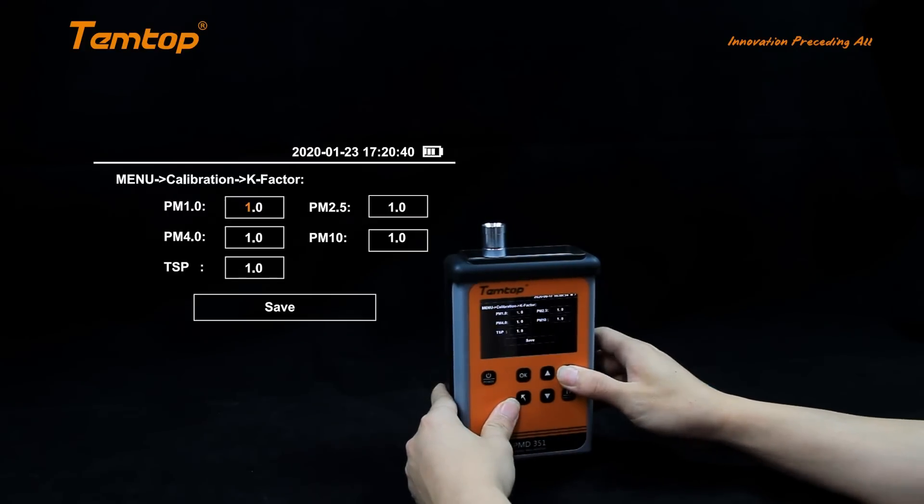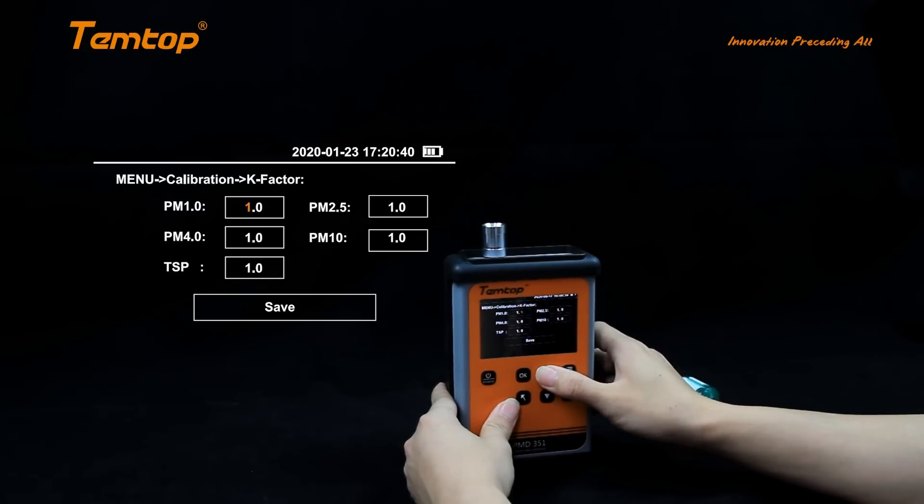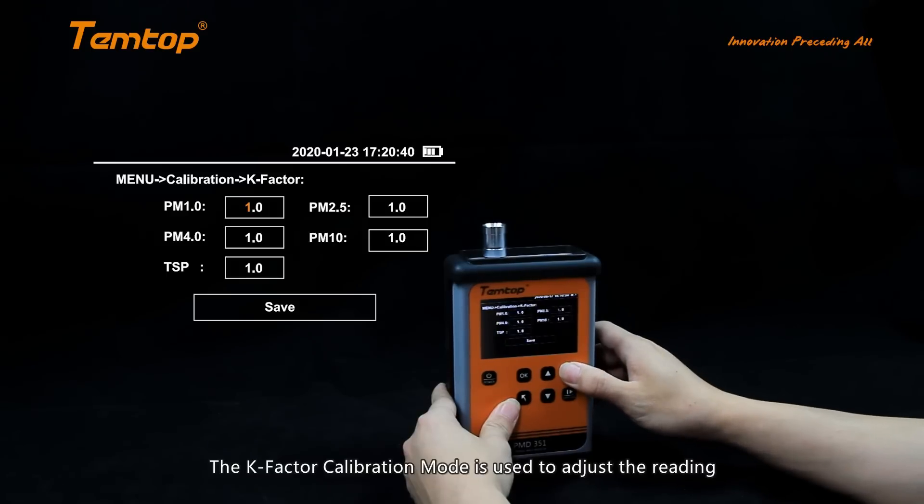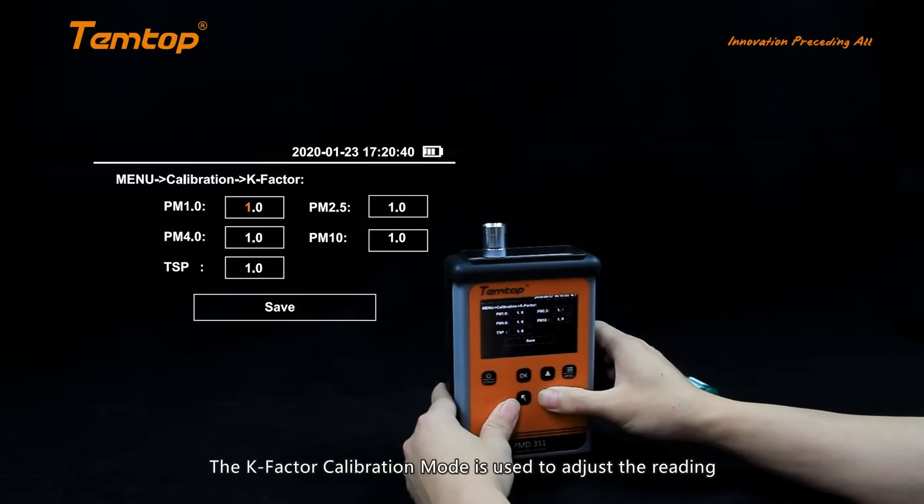K-Factor Calibration. The K-Factor Calibration mode is used to adjust the reading by changing the coefficient, which ranges from 0.1 to 9.9.